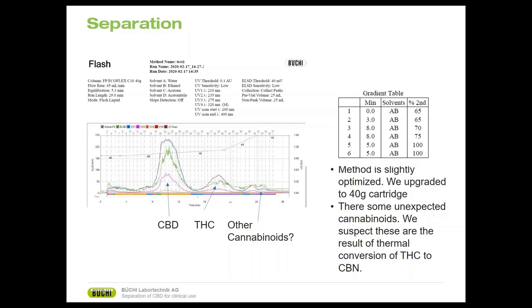So this is the second run we did. Again, we started with a 65 gradient of ethanol. And then we found out that CBD is coming somewhere at 68, 69. So we said, instead of going from 65 to 100, let's go step by step. So in 8 minutes, we increased our gradient from 65 to 70, and in 8 minutes from 70 to 75. Because again, in the beginning of the 70, 71, you start to get the THC.